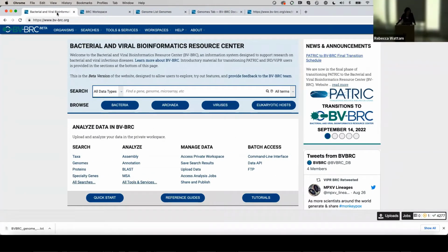Are you all caffeinated and ready to do some bioinformatics?